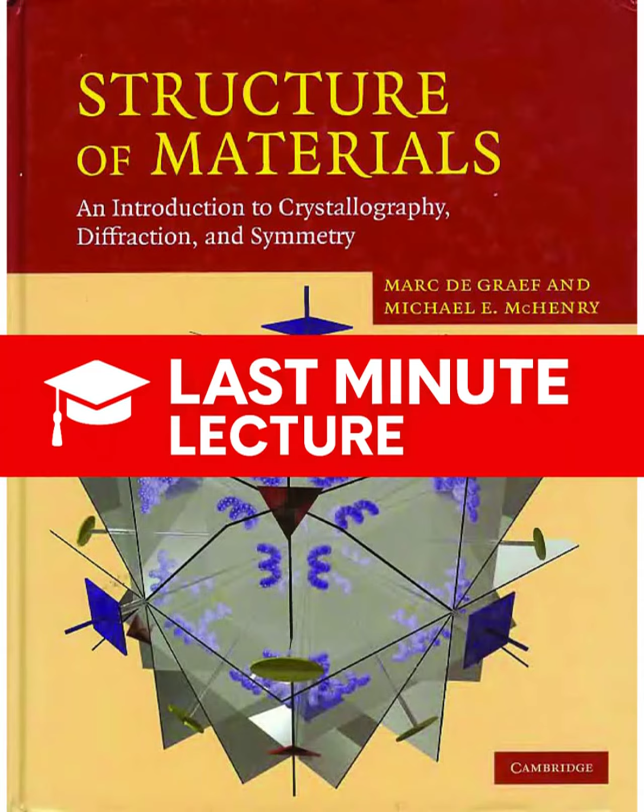Now we shift completely to the Laue methods, which represent the total opposite strategy from powder diffraction. We use a stationary single crystal. And critically, we use polychromatic X-rays, the continuous Bremsstrahlung spectrum. So what's the logic there? It's simple but brilliant. If the crystal is stationary, the angle theta and the spacing d are fixed. If you only had one wavelength, the probability of satisfying 2d sin theta = lambda would be basically 0. Right, you'd have to be incredibly lucky. But by supplying a continuous spectrum of wavelengths, you guarantee that for every fixed d and fixed theta, there is always some available wavelength lambda that will satisfy the equation.